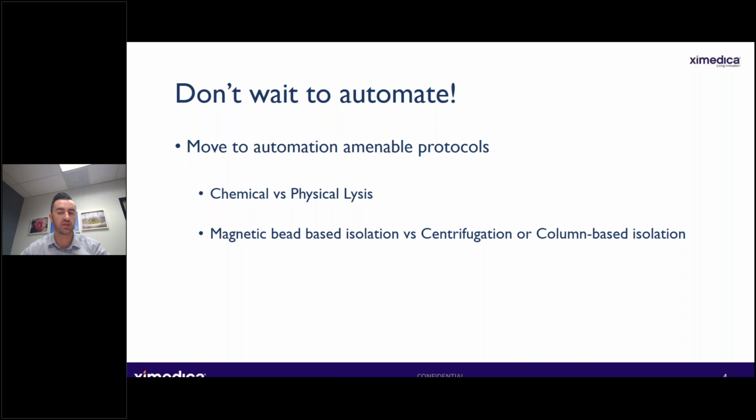Another example of a more automation-friendly protocol element is a magnetic bead-based DNA isolation instead of any centrifuge-based ones. And while a centrifuge itself might not necessarily be difficult to automate, they can be quite a bulky, expensive piece of equipment, whereas a bead-based isolation protocol can utilize whatever fluid transfer mechanism is already employed in your system, along with the addition of some magnet actuators.